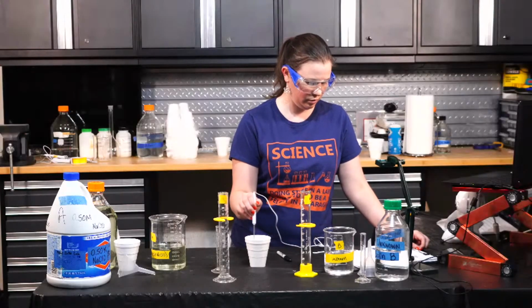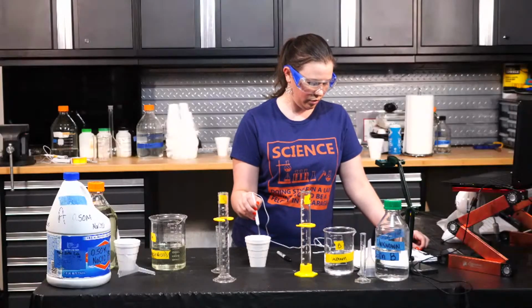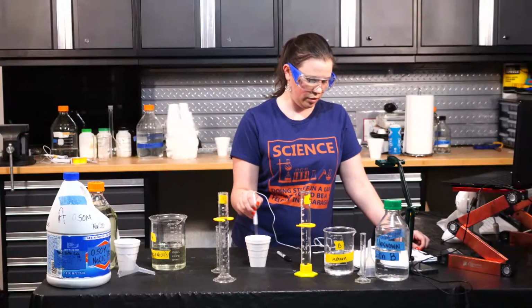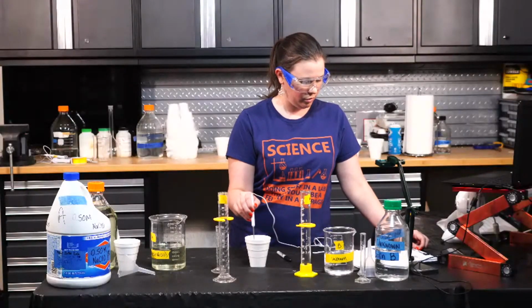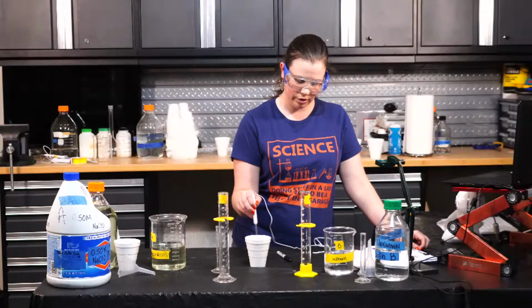Still 21.4. So I believe that is our final temperature for level 1, 21.4 degrees Celsius.